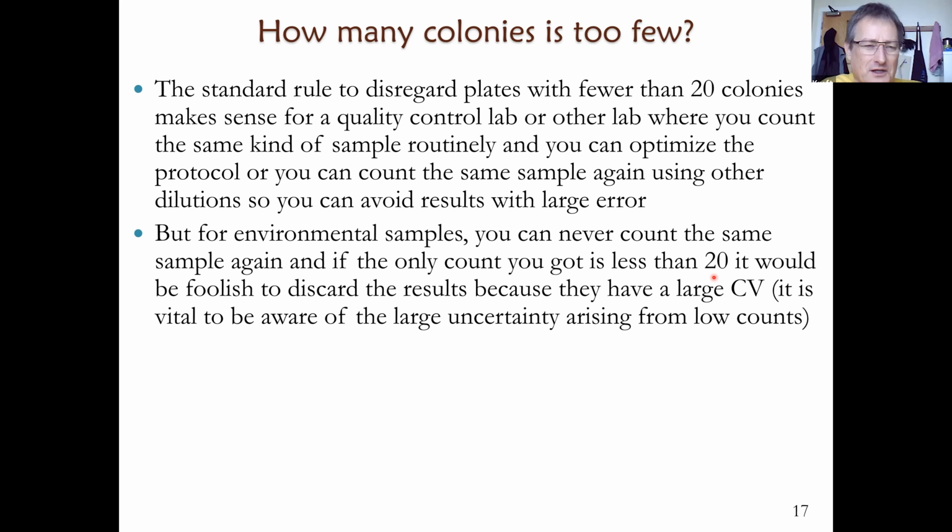But if you have just one count or so, as you know, the error is large. For one count, it's 100%. So you have to be careful with interpretation, but don't ignore this.